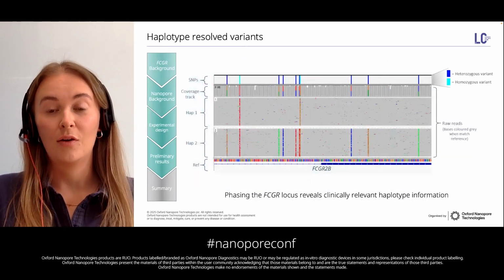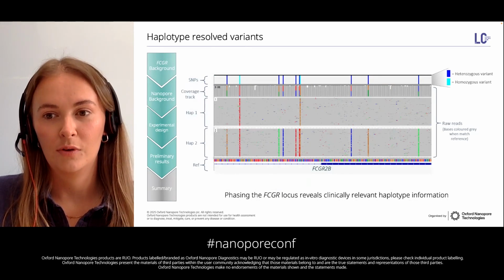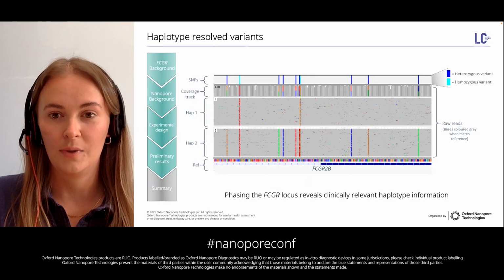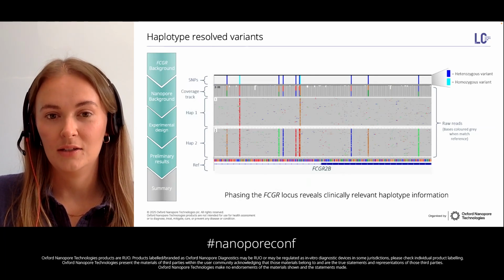Likewise, we can also look at regulatory SNPs. In this region are 2 well-known polymorphic positions that define a promoter haplotype which impacts the expression of 2b and 2c. But accurate genotyping has long been a challenge.